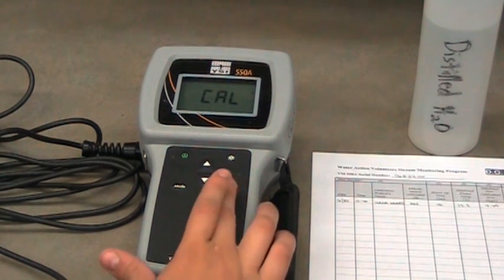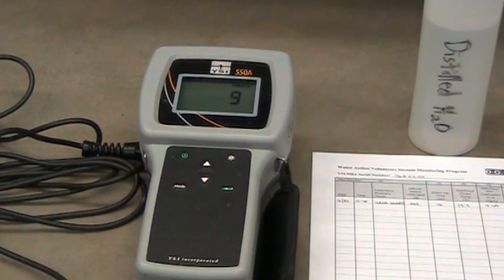Press enter on the meter. The enter button is the one with the sideways arrow. A value for altitude will appear. The number displayed when multiplied by 100 is the altitude in feet. Adjust the altitude with the up and down arrows to the correct value for your location. Round to the nearest 100 feet. Press enter.